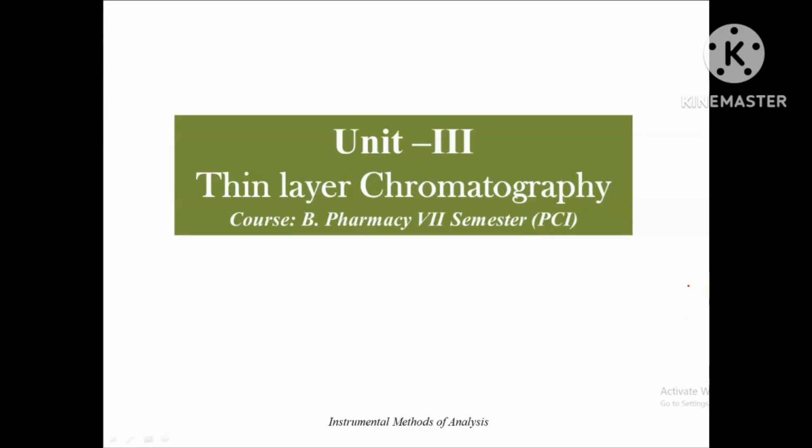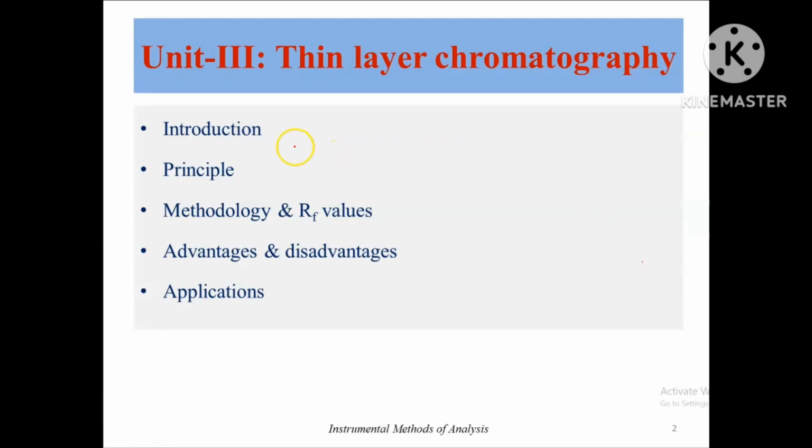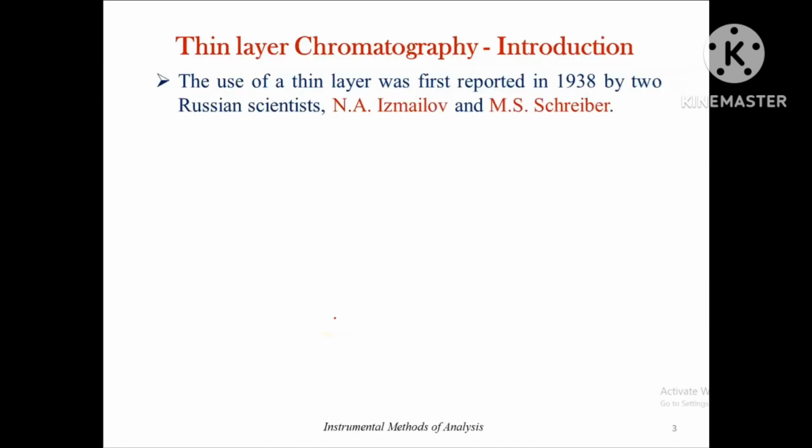Hello students, in this video I am going to discuss the concept of thin layer chromatography, which is a topic from Unit 3 of Instrumental Methods of Analysis of B Pharmacy 7th semester program. The contents include introduction, principle, methodology, RF values, advantages, disadvantages and applications of thin layer chromatography.